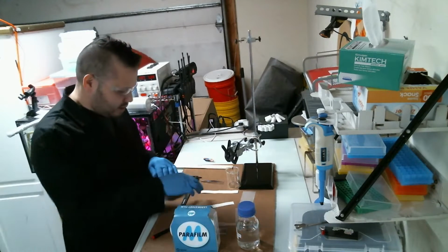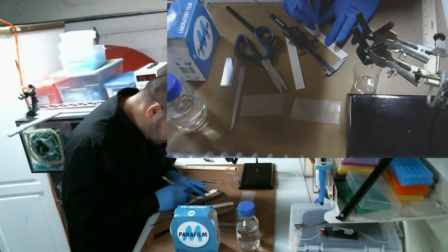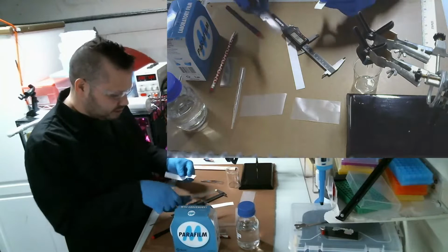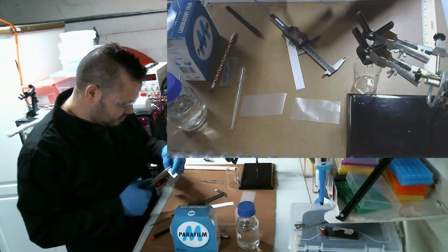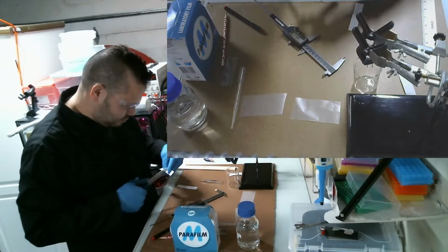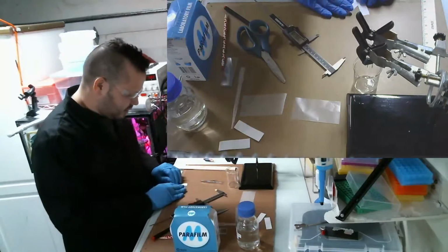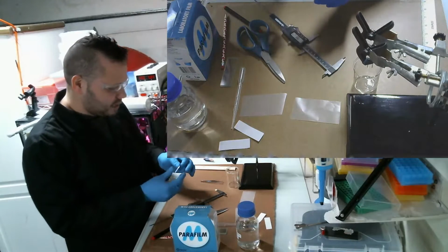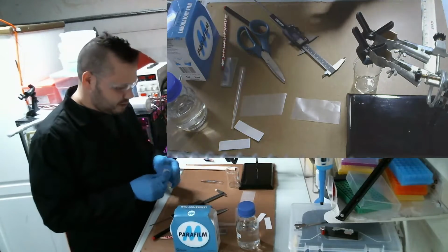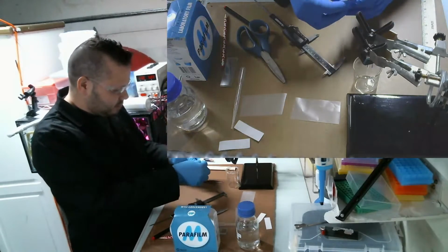Now I need to cut these two strips to be 88 millimeters. And I got to make sure to mark it with pencil, because if I mark it with pen, you're going to end up contaminating the experiment with pen ink. There we go. The idea of this experiment is that I can soak this with a solution that, when it dries, the solid part of the solution should stay in here, and then it should hopefully turn a pinkish color when it comes in contact with indole acetic acid.